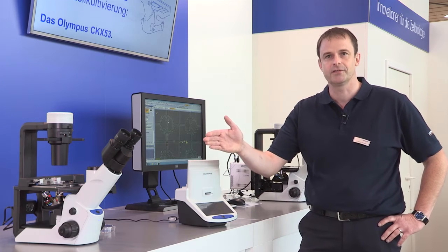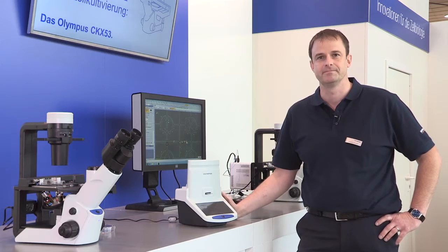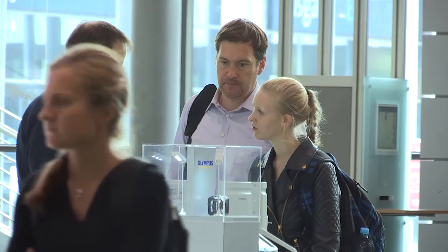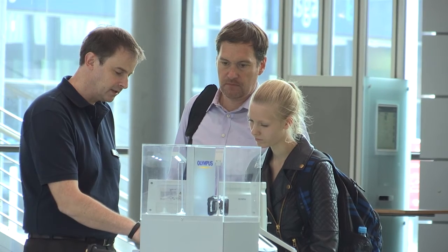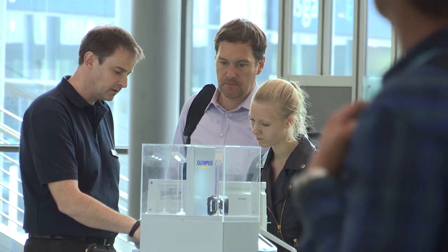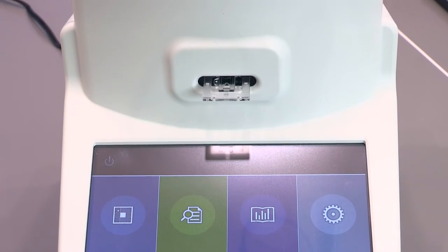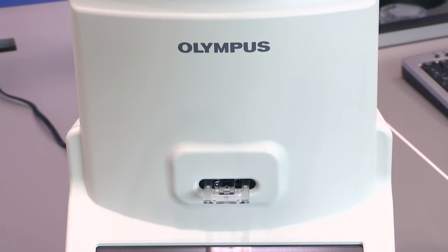Before we move to this new promising product — the cell culture microscope — I'd like to give you some insights on the handling of this cell counter. Olympus has interviewed a lot of customers in the cell culture lab with the target to see in which way the routine work can be facilitated by using certain automation. As a result, we found that the cell counting process can easily be facilitated by using the cell counter.